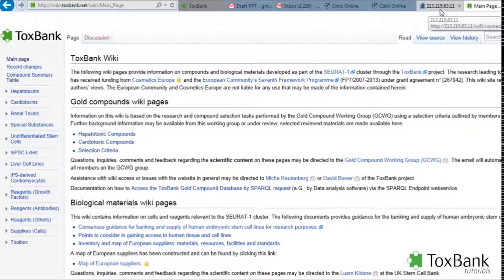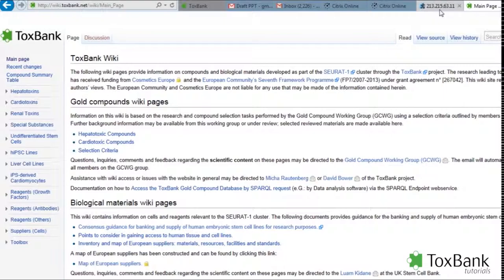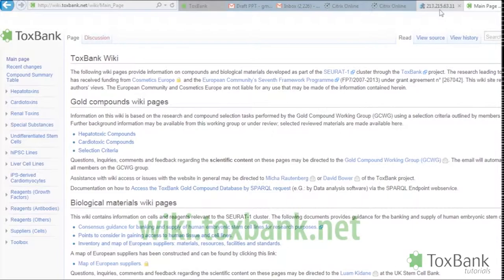The following tutorial will outline reagent information that's available in the Toxbank wiki. Also, we'll discuss its links to the Toxbank data warehouse.